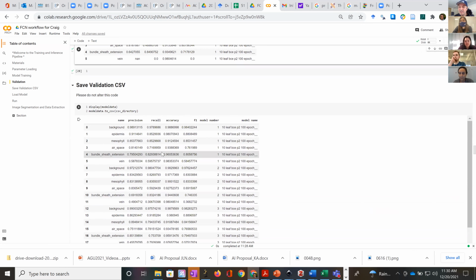Now, here's the same. I did 100 epochs in the past rather than 10 epochs, and I trained 10 models. These are the results on that same training set. What we see is that there is variation.